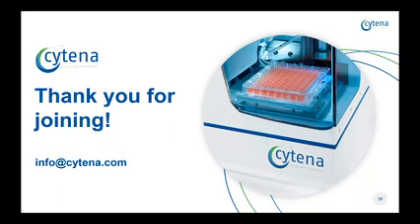We can also use PCR well plates, so not only culture plates. For 96 well plates, it takes between 2 to 5 minutes, and for 384 well plates, it takes approximately 4 times longer, a little less, around 10 minutes for a typical experiment.